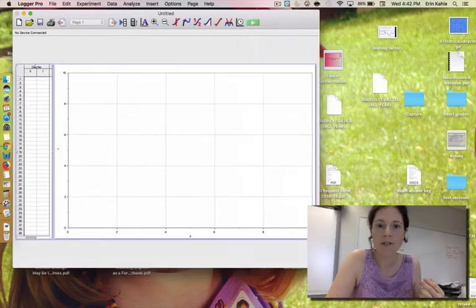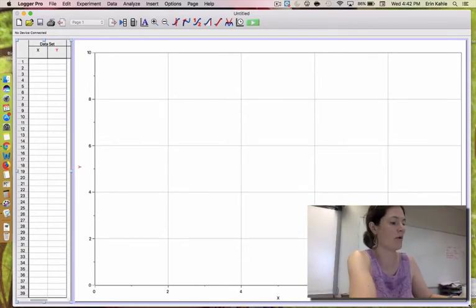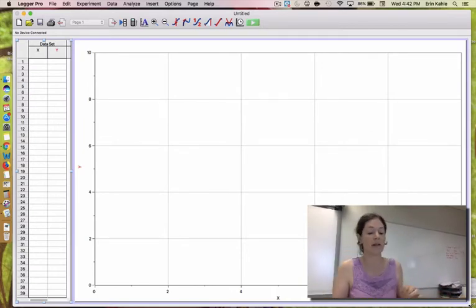Hey guys, so I just wanted to record a quick video about how to use the CO2 probe, in case I'm not around or in case you need to look up how to do something.